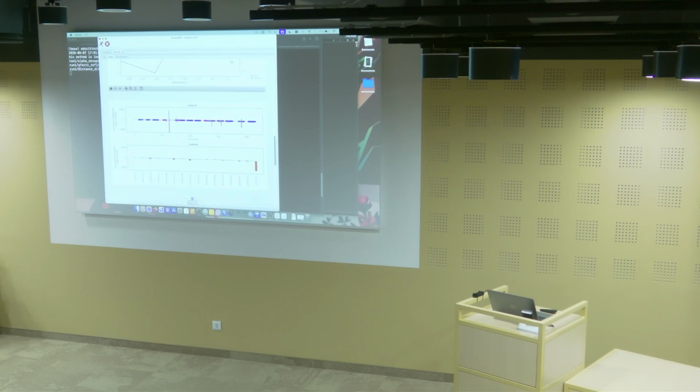Then let's see if we need to update this. Then here we have the results of the alpha or occupancy determination. So again, we use alpha equals 1 over occupancy. If you use another relation between this extrapolation factor and the occupancy, just don't look at the right part, just look at the left part and do your calculation yourself.